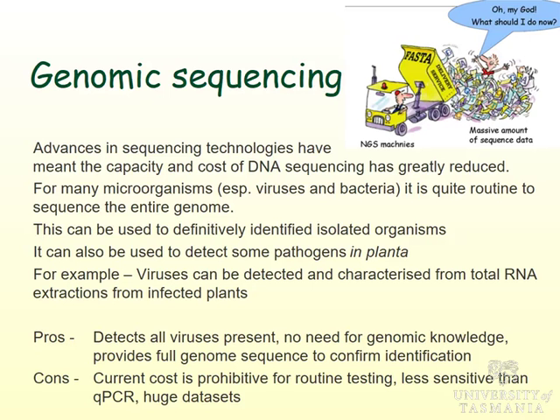You've got a culture, or an infected plant, you can go and extract nucleic acid, send it off, blast the whole thing, get a sequence, and then look for the presence of a particular pathogen by the sequence. And rather than PCR where you're amplifying a couple hundred base pairs, or that restriction digest where you're really detecting 6 nucleotides, here you're getting the entire genome of the organism.